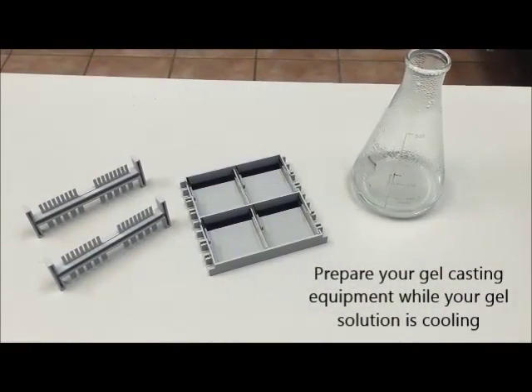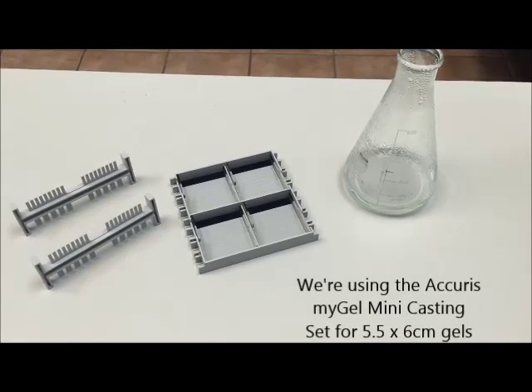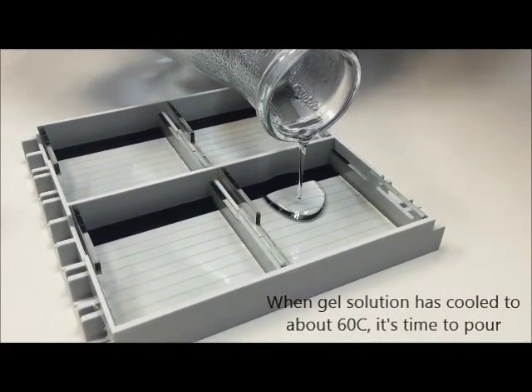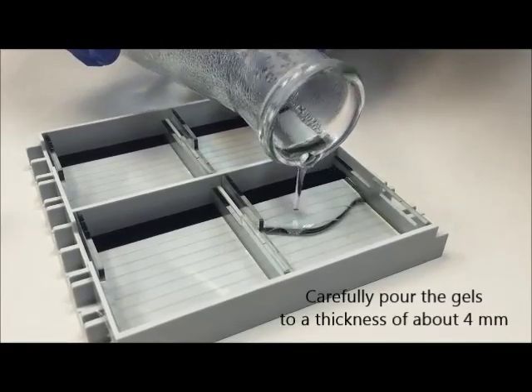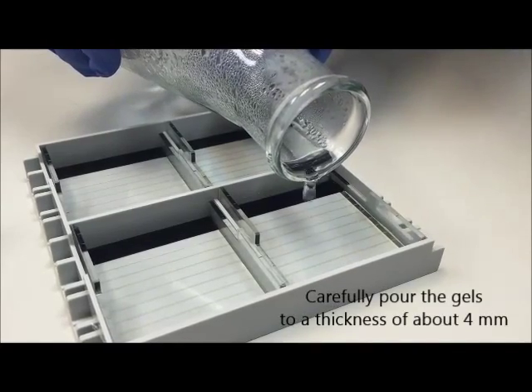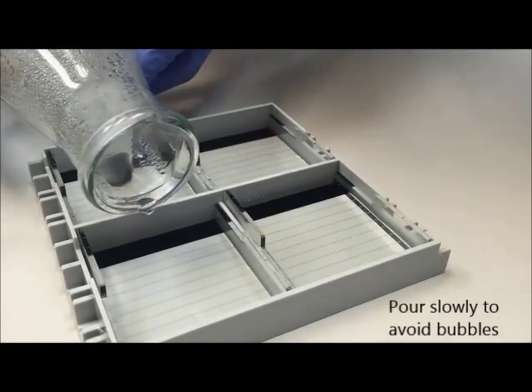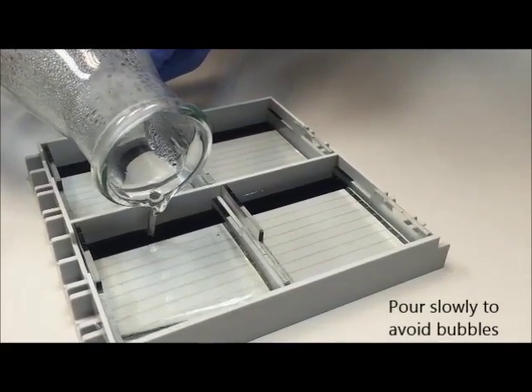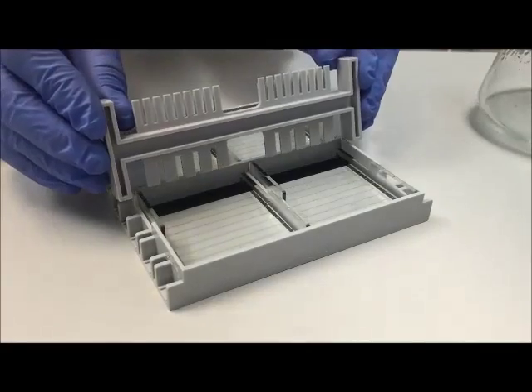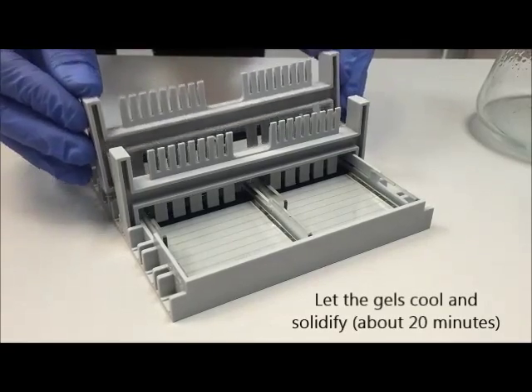The next step is to prepare your gel casting equipment. We're using the Acuras MiGel casting set that comes with the MiGel system. It's important to let your gel solution cool to about 60 degrees before pouring, otherwise you can warp the gel trays. Carefully pour the gels to a thickness of about 4 mm, and try to prevent any bubbles forming inside the gels. Any bubbles that do form can be removed quickly with a pipette tip. Now put your combs into place and let the gel cool for about 20 minutes.